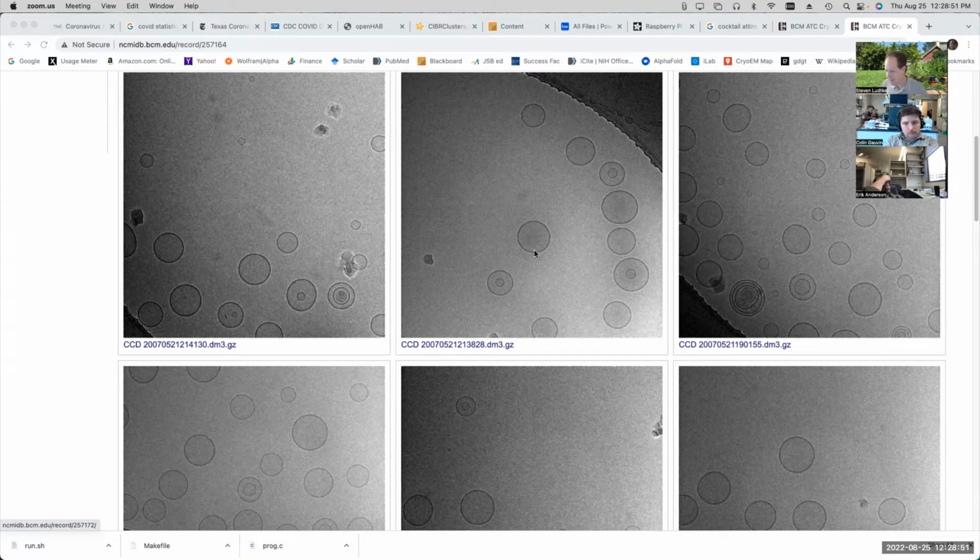So if you asked me how I would go about simulating some sort of an ellipsoid or something like that and try to make it look more like realistic cryo-EM data, I want to avoid having my algorithm focus on the mean density inside versus outside. Because if you go closer to focus, that fades very quickly.